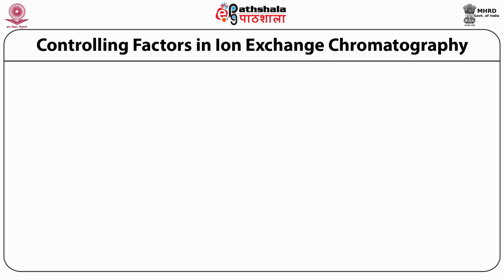It is very important to know the factors that actually affect the performance of an ion exchange chromatograph. There are various factors such as ionic charge, which is represented as Z, and ionic radius, which can be represented as R, that play a significant role during the separation or elution of compounds in ion exchange chromatography. The separation of compounds from the mixture which is injected into the ion exchange chromatography is based on the electrostatic bond energies of ions in solutions.